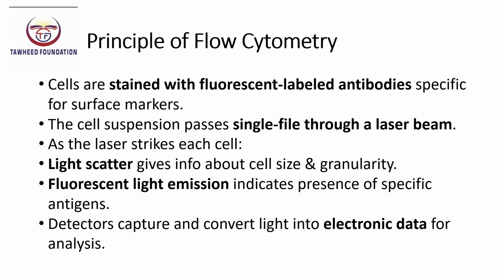Detectors capture these signals and electronics convert them into graphs, histograms, or numerical data. This allows quantitative and qualitative analysis of cell populations, making flow cytometry a versatile tool for both research and clinical applications.